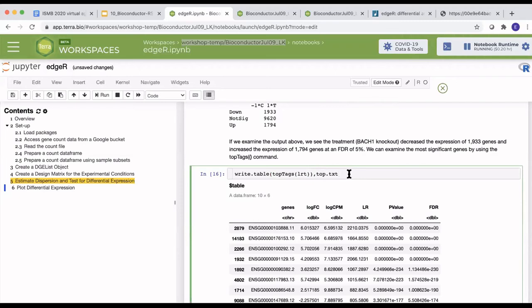You need to write file name equal and then put the name in quotes. Right here? Maybe here? File, I don't remember, and quotes. File, only file. File and quotes. Does that look right for those who are looking? And missing closed brackets. In closed brackets. What, the file needs to be in closed brackets?